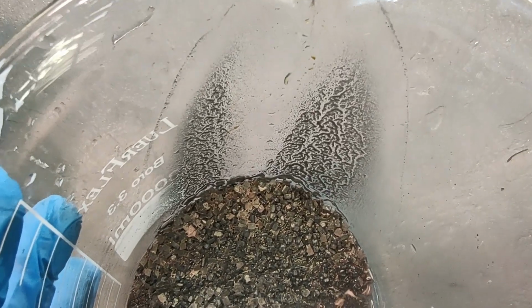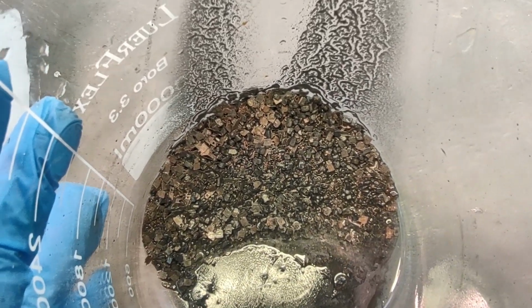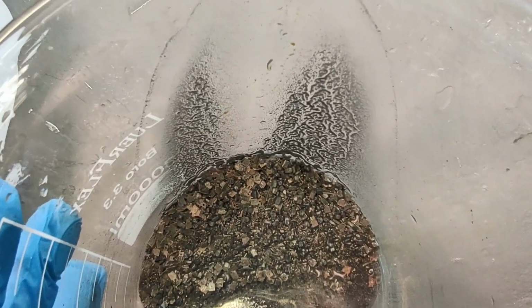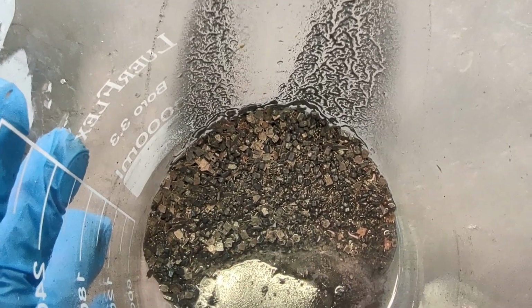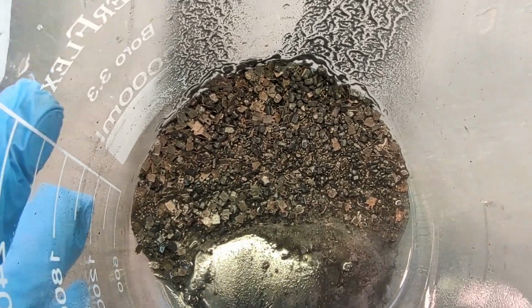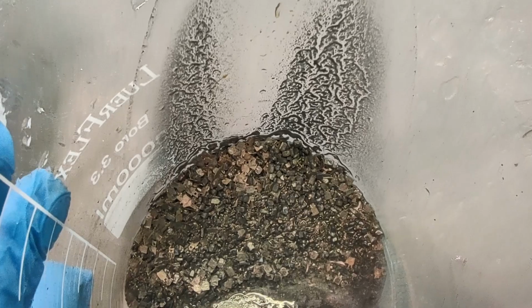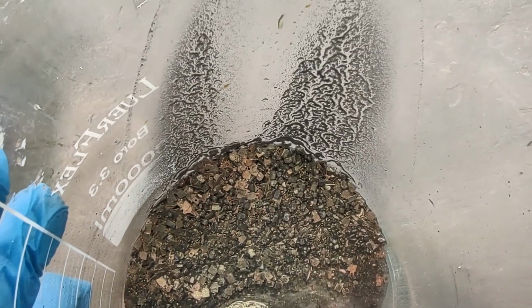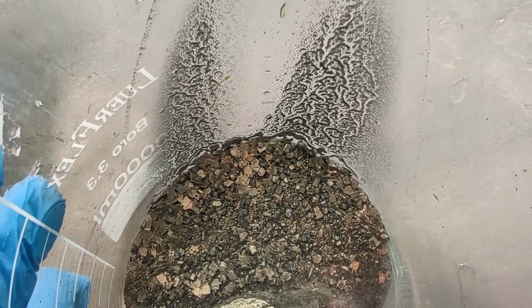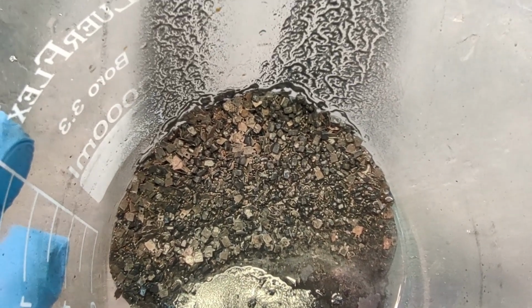Getting a lot of black powder out of it too, which I think is probably very, very fine grains of carbon from the steel that's been dissolved. Steel is really an alloy of iron and carbon with other trace metals thrown in. So I'll bet all this black powder is just carbon that dissolved out of the steel.